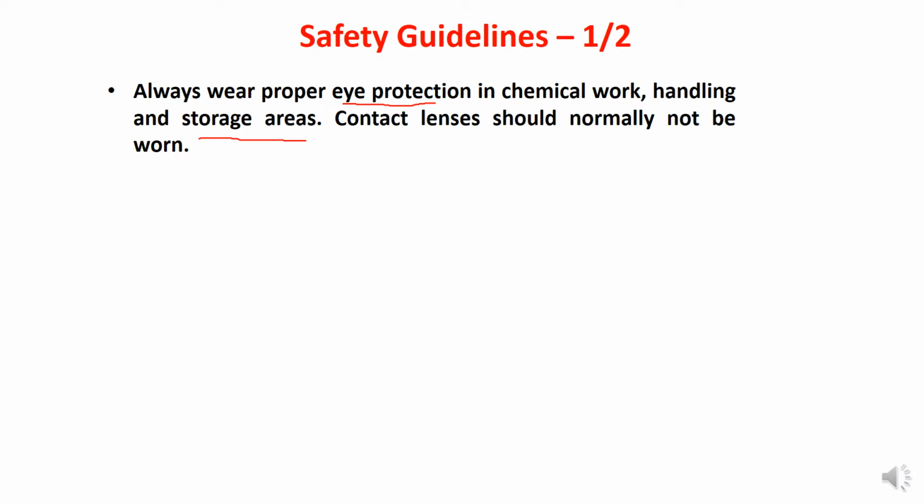Don't use contact lenses. Once you visit a storage area, you may need to wash your eyes, and if you wear lenses that get contaminated, the contamination will stay in your eyes. I don't know whether you take good care of them or not, but there are chances they can cause irritation to your eyes. So this is one guideline, and I hope you can follow it.